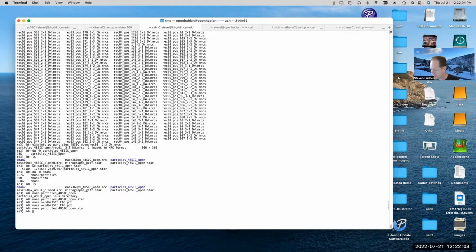EMAN, on the other hand, had historically used other approaches than this. Ten years ago, we were using this sort of BDB approach for storing things, which was a local database format, and is actually one of the reasons why people switched from EMAN to Relion so heavily back 10 or 15 years ago, because of the annoyance of that strategy. So about 12 years ago, we switched from that database strategy to JSON files.